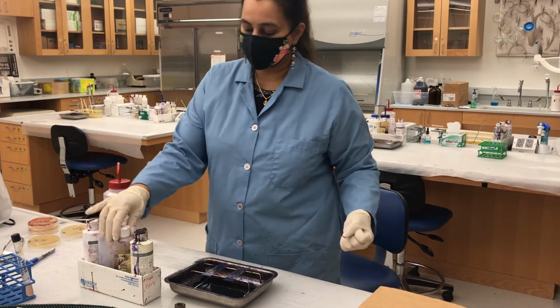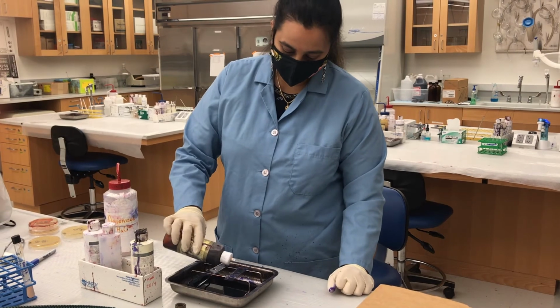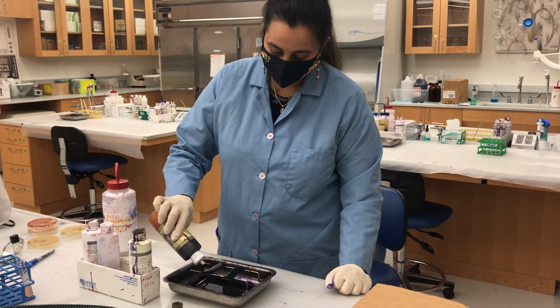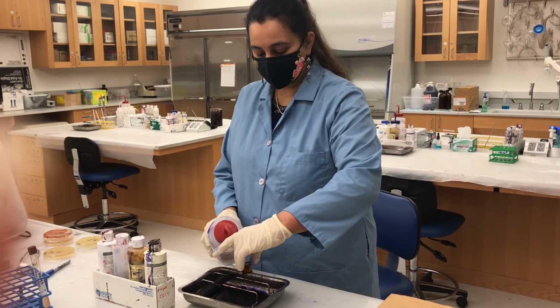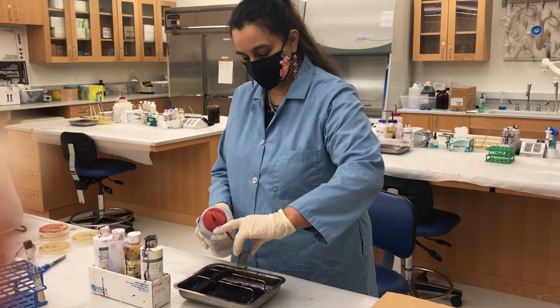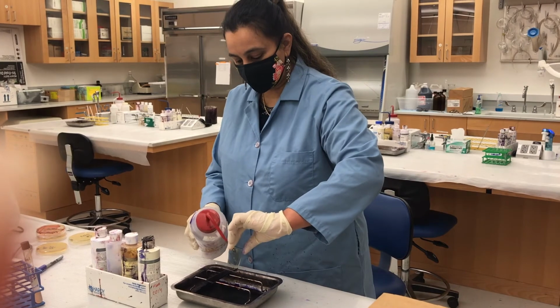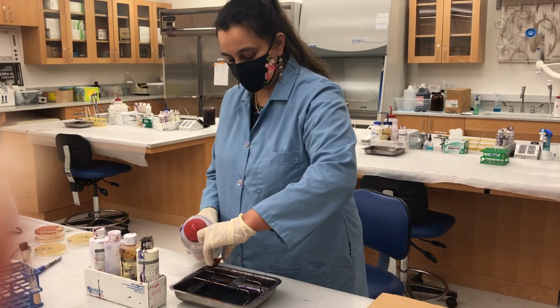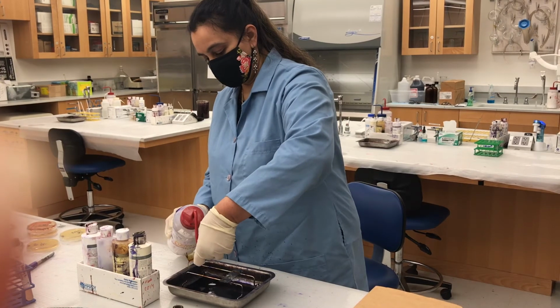The second step is to add the Gram's iodine solution. So I have the Gram's iodine here. Once again, cover the slide completely with the Gram's iodine and leave it on for one minute. Okay, the 1 minute is done, and I am washing off the Gram's iodine the same way that we washed off the primary stain, front and back. And remember where you have your cells. Remember not to flip. Right, washing the slide front and back.